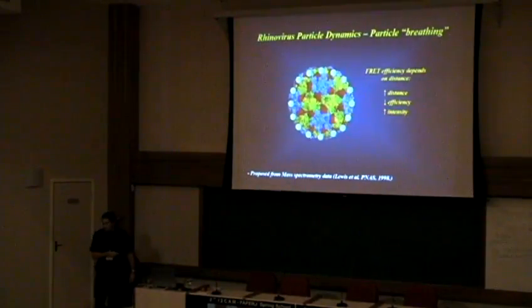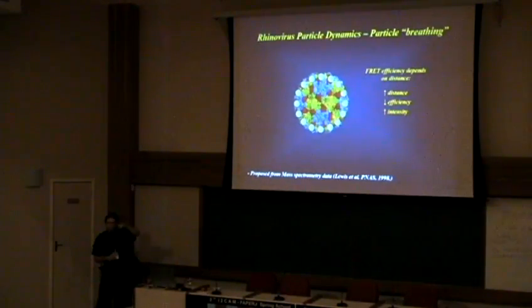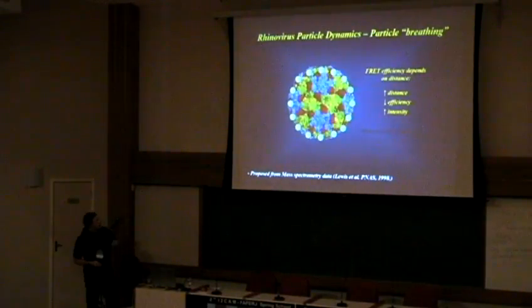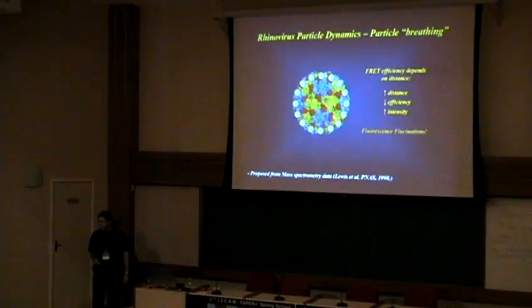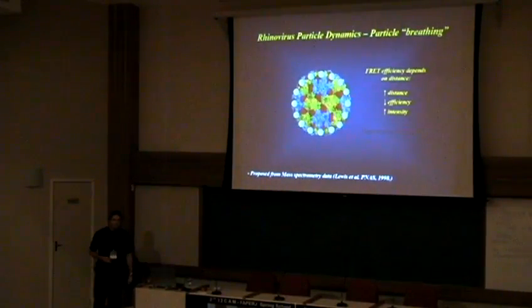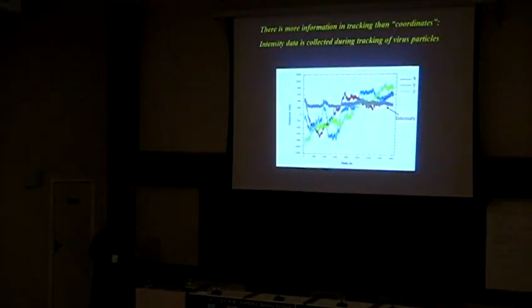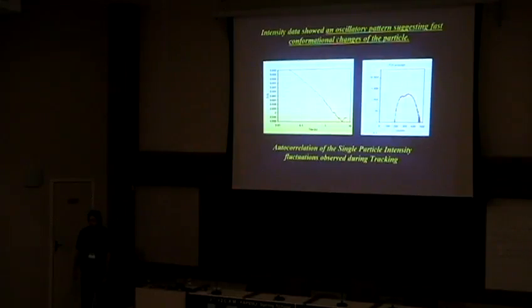will change with time. Remember that we have an oscillatory pattern of our fluorescence intensity. So we have fluorescence fluctuations, and we know how to study this. We do FCS. So we take this fluorescence trace and calculate the autocorrelation function for this. And it shows nothing. This autocorrelation is actually tricky to interpret. But when we do the distribution of the fluctuations, we actually see two different populations here.